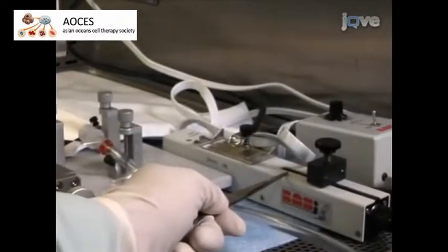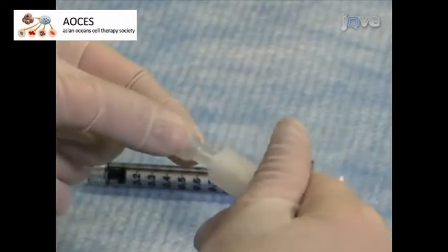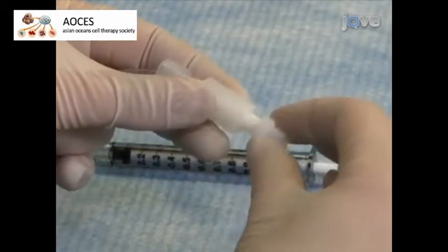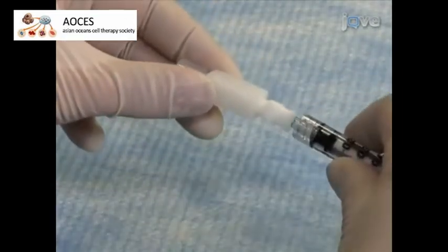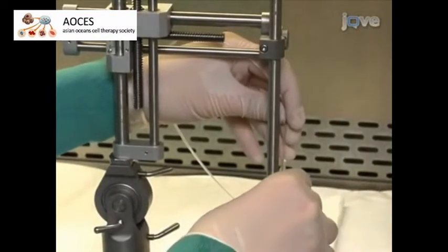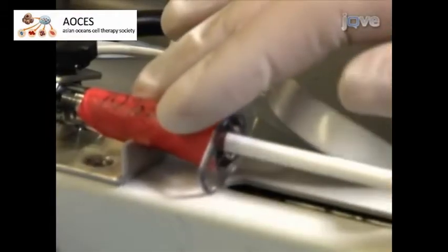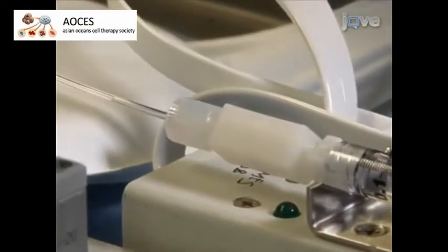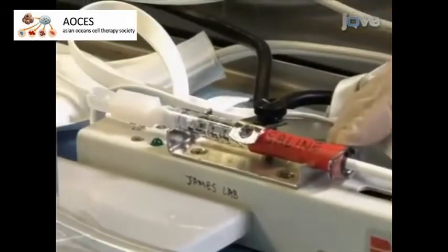rate syringe pump. To set up the cannula, attach a 1 ml syringe to the Teflon tubing using a set of plastic syringe adapters. Affix the cannula to the stereotaxic frame so that it's perpendicular to the surgical surface. Using a 1 ml syringe, disinfect the cannula by running 70% ethanol through it. Repeat this process using sterile saline.